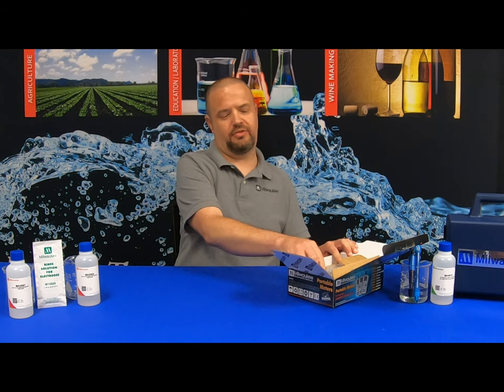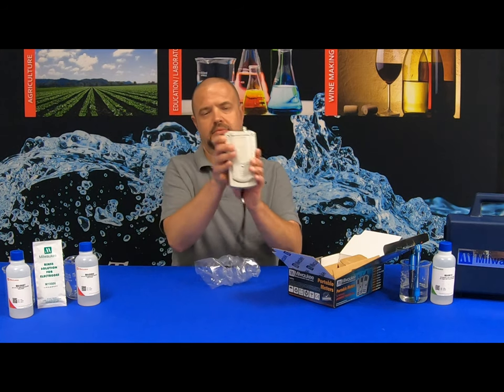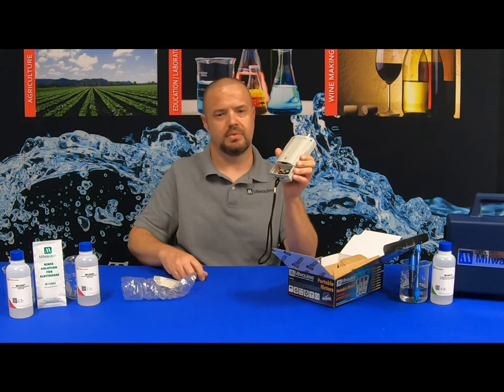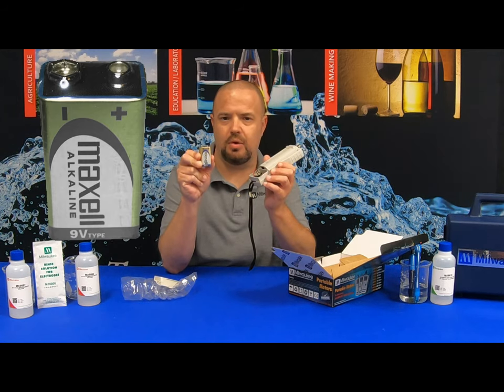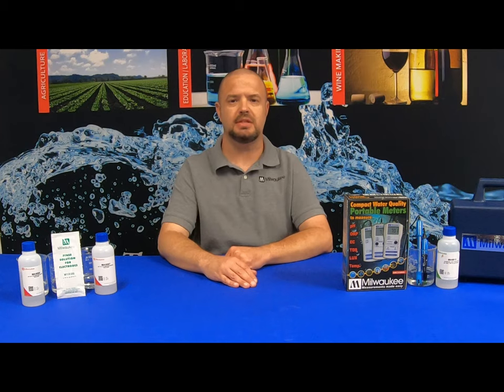Next, we're going to remove the unit from the box to install the battery. Simply take the battery compartment and slide it down to expose the battery terminals. Also included with the unit is a 9-volt battery. Please be sure to remove the plastic covering around the battery before connecting to the unit. If your Milwaukee Instruments MW102 displays EB, that is simply an indication it's time to replace the battery.